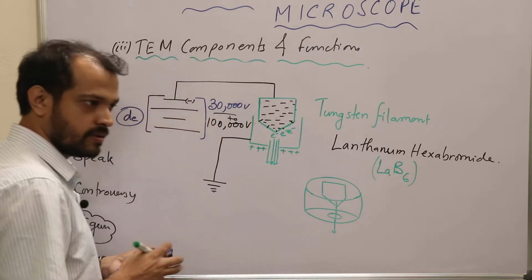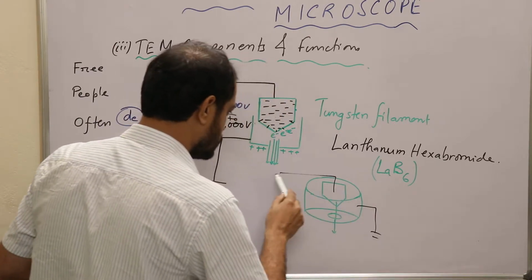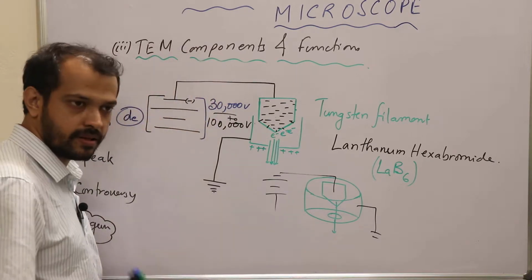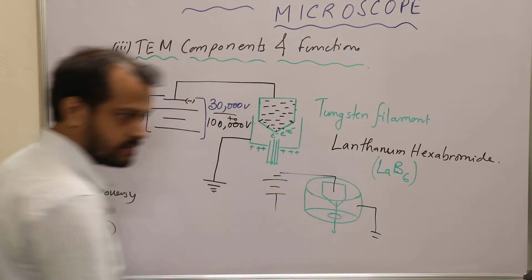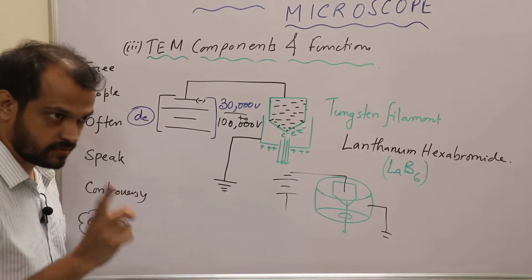Okay? Clear? It is connected to ground. It is connected to the negative terminal of the battery. Right? Clear? This was the total structure. Now listen. It's not yet finished. We have not yet finished. Now listen.